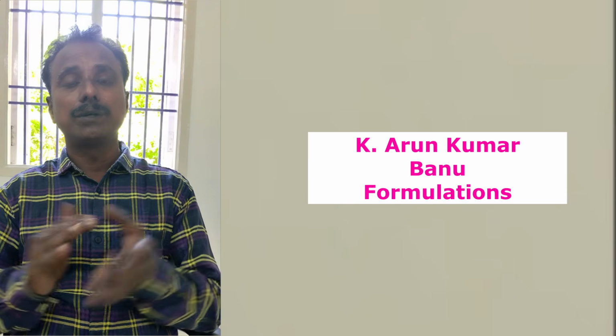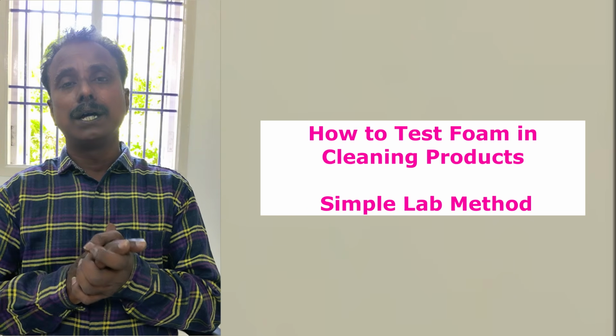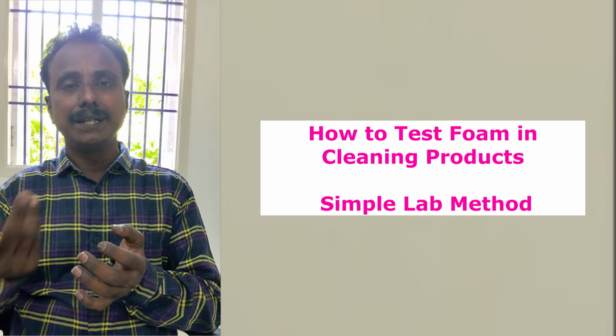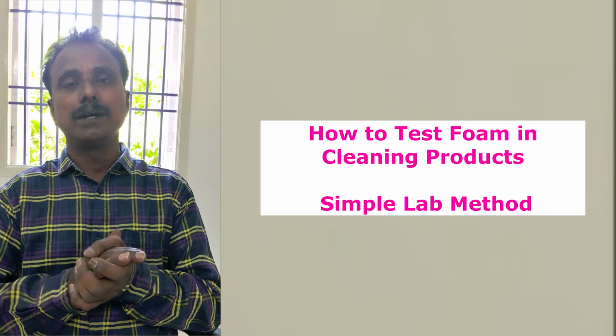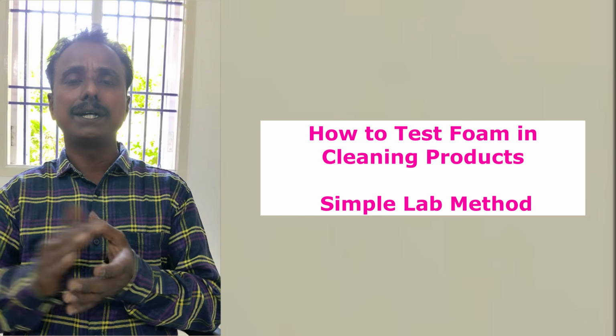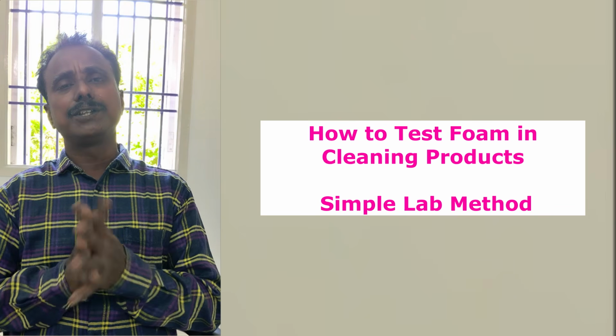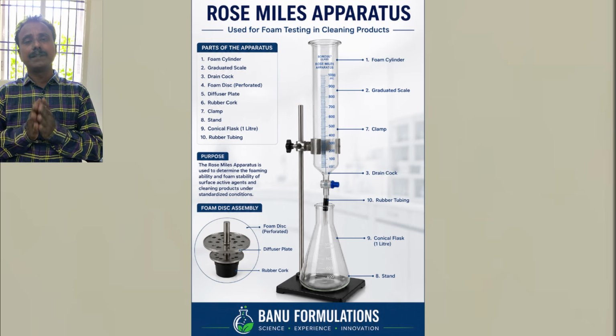Today we are going to discuss foaming property. Of course, we are going to give a demonstration of how to check foaming property in cleaning products. In case of cleaning products, foaming property is one of the important quality control parameters. In sophisticated laboratories, they will use a Ross-Miles apparatus to check the foaming property. It is a dedicated apparatus for testing foaming. Or otherwise, we can adopt a simple method.